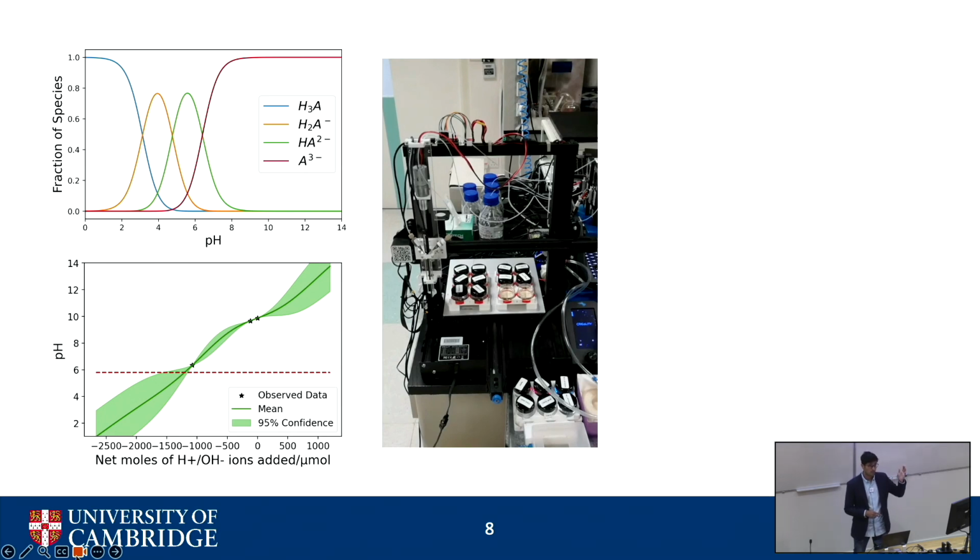So for example, at high pHs, citric acid will fully deprotonate and release 3 protons into solution, whereas at low pHs and very acidic conditions, it will not release many, if any, protons at all. And I'm happy to go into any more detail about the method too. It's out in Chem Methods.